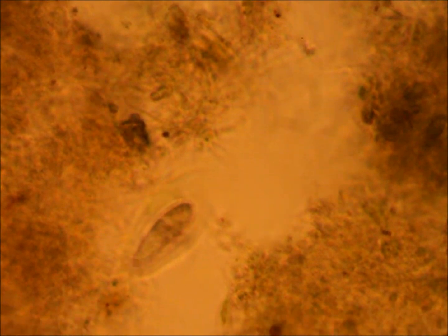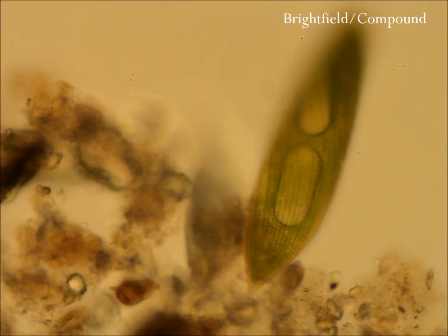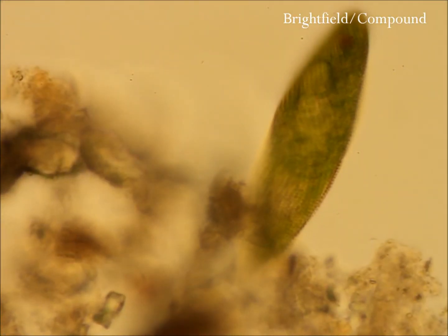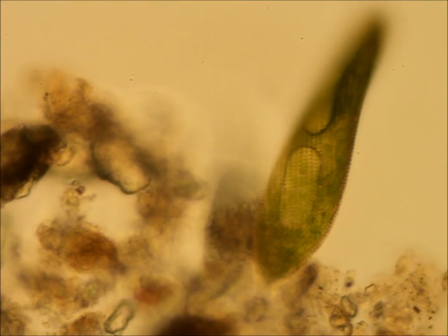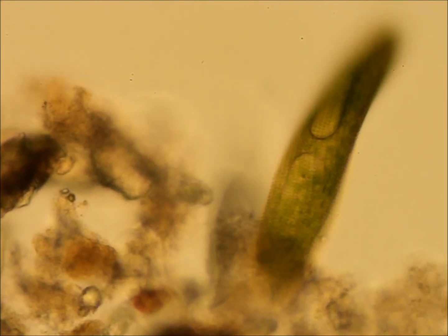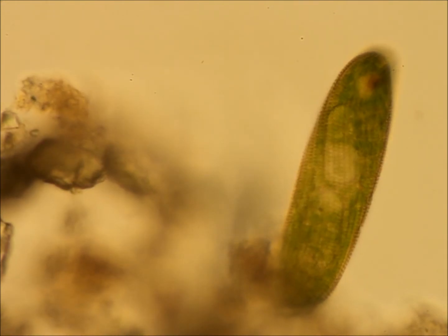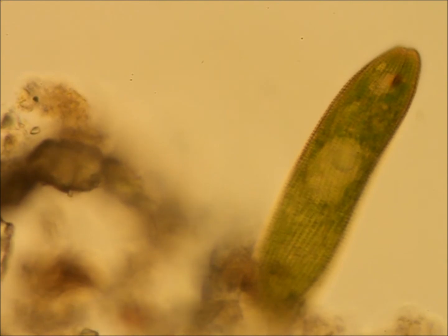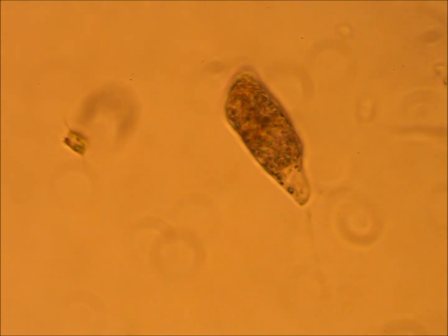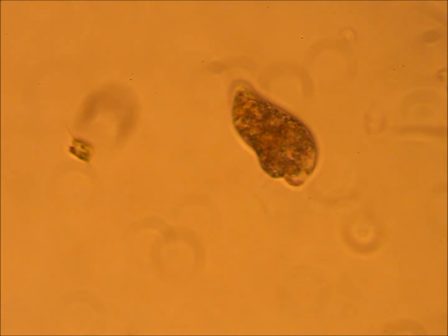While some of the life collected had died, amongst the few survivors was a single and very interested microorganism. We'll call her Blanche. Blanche is a Euglena, a dazzly green eukaryote. Here, Blanche is performing an exotic belly dance. She lacks a sturdy cell wall, so she can change her shape to maneuver around the conditions in her environment easily. Blanche also has a light-sensitive eye spot, shown here, called a stigma, that allows her to dodge her haters, and there are many.